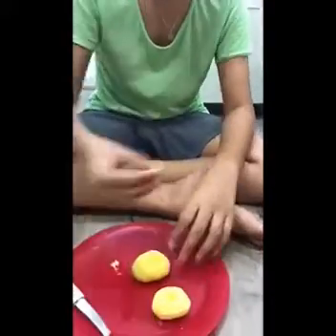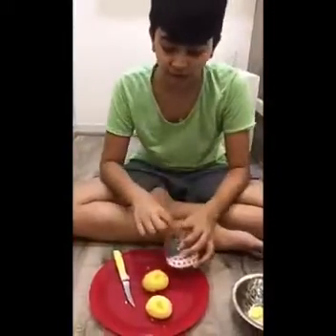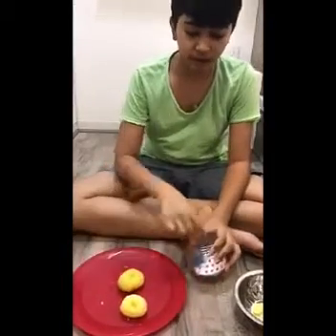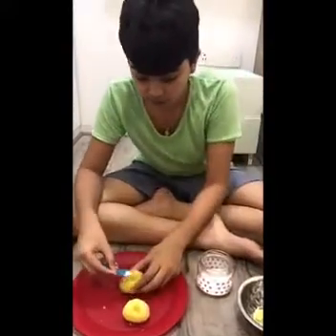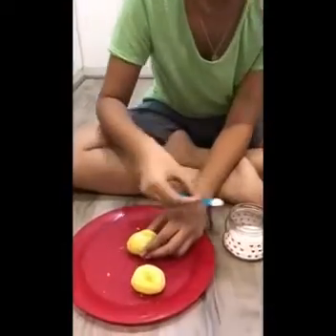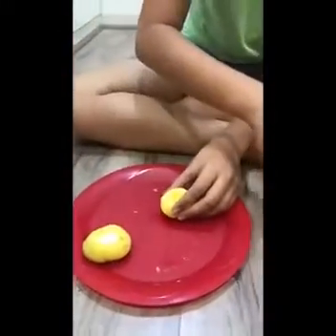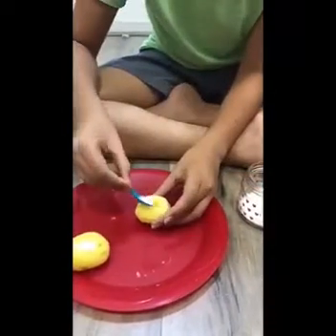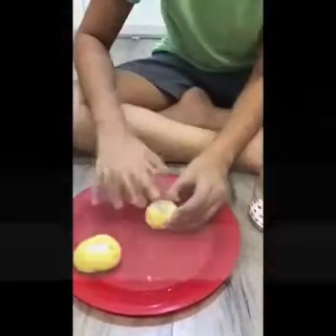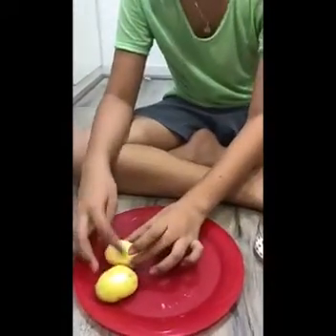So now what we are gonna do is we need to take some salt. As you can see, I have some salt over here. Then we need to fill up the holes with salt. So let's do so. The boiled potato is covered with salt, and now it's time for the raw potato. So let's do it on the raw potato. So we have filled up both the holes with salt.